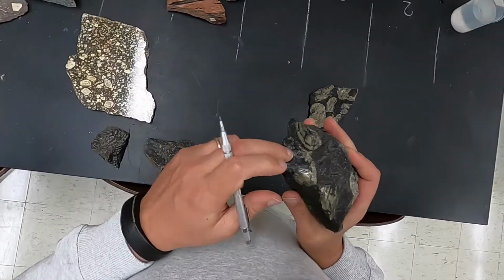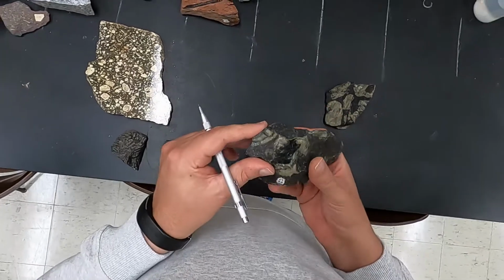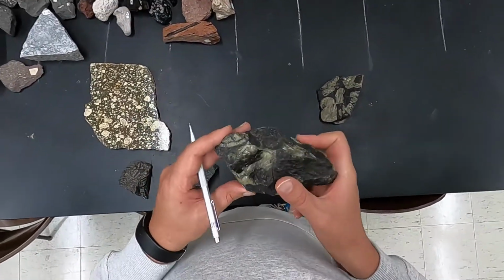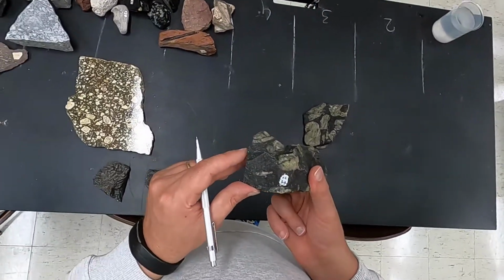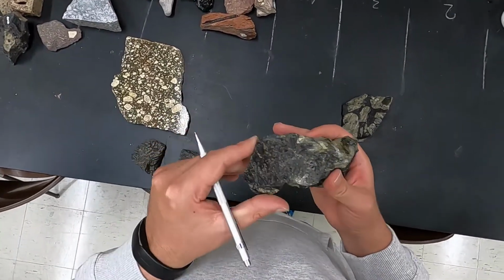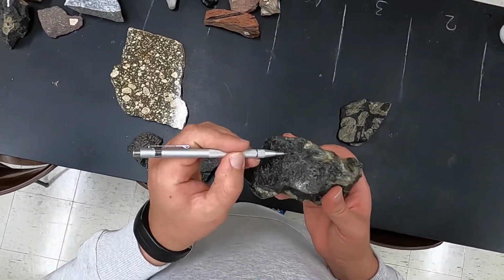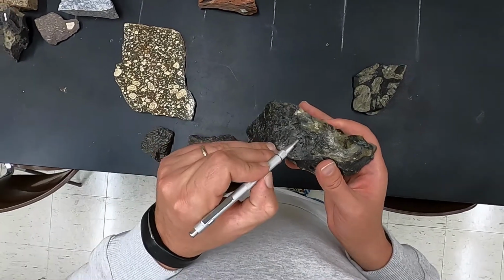Here this could be also some pyroxene that was deposited on the surface of some of these fractures along a crystal of plagioclase. Here I see better these dark minerals, so mafic minerals.